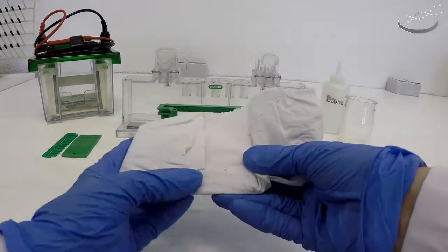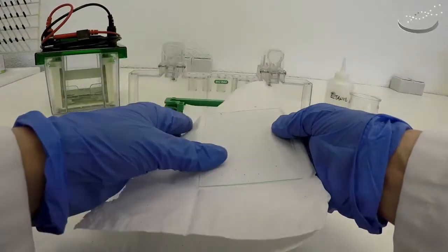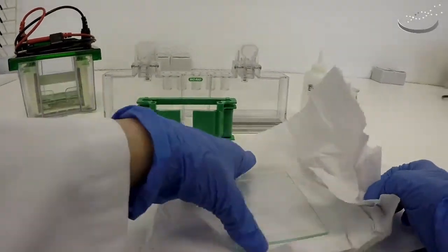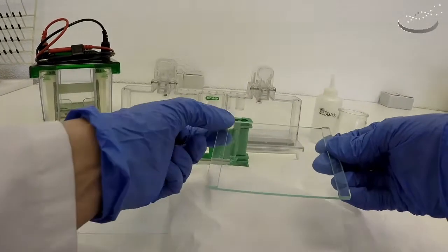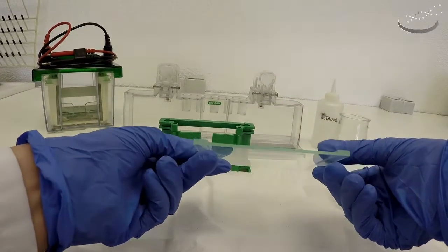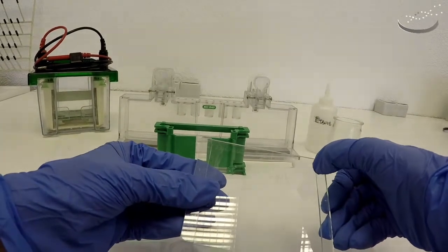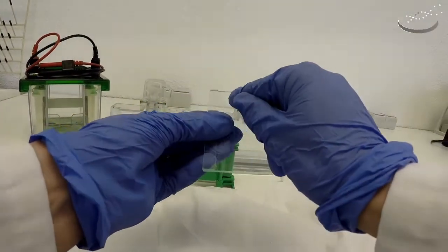The first thing that we need are the two glass plates. There are two different plates, two different sizes and shapes, and with different characteristics. This is the short plate, just a plain piece of glass cut to a specific size. The other plate is the back plate, or the large plate. This plate comes equipped with two spacers, one on each side, and there are different widths. This one is a 1.5mm width for the gel. You can see here they're tapered at the end, and it's written on the glass: UP, BioRad, and the 1.5mm indication.